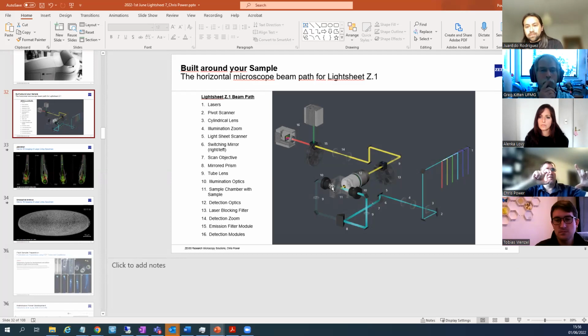Now, the first time we did a light sheet conference back in 2009, 2008, all the home builders asked each other, how do you choose? Do you make it thicker in the middle, so you can be more uniform, or do you make it really thin in the middle, and it's massive at the outside? And everybody had independently come up with this way of saying, we set it twice as thick at the edge as in the middle. And the reason they do that is because the axial resolution is determined by the excitation and the emission PSF, you tend to not notice any difference. You get a reasonably uniform Z section across the range.